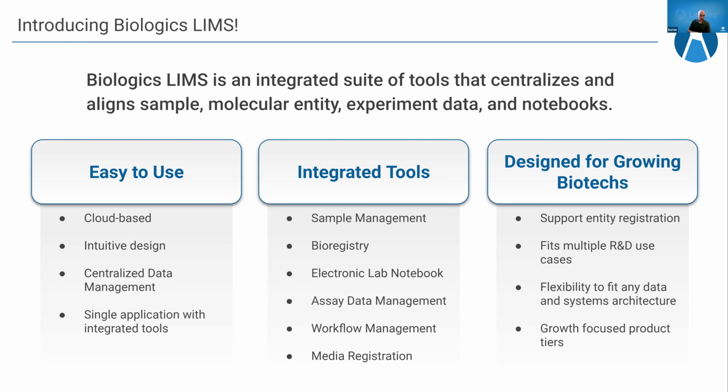Then there is collaboration tools. There are a variety of other forms of communication besides the data itself that are critical. Scientists need to convey previous work, results, critical conclusions, notebooks, methodological guidance, and things like requests of each other. And having all of those in one system, in the same place as your data, is highly enabling.